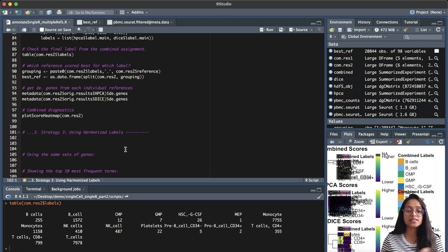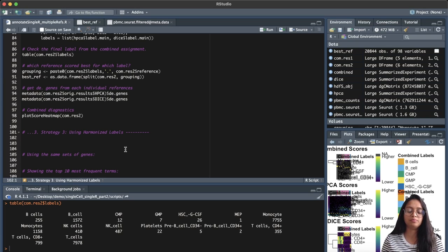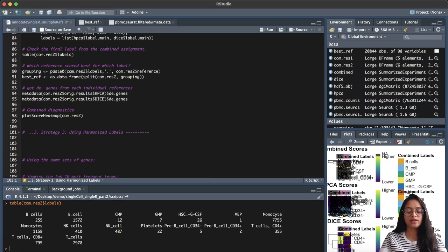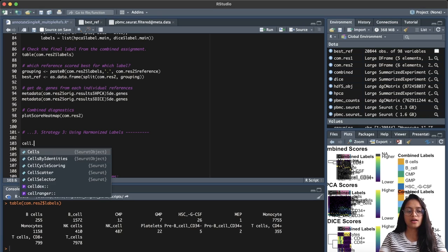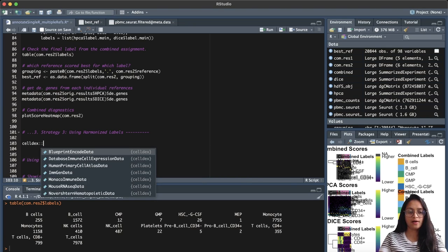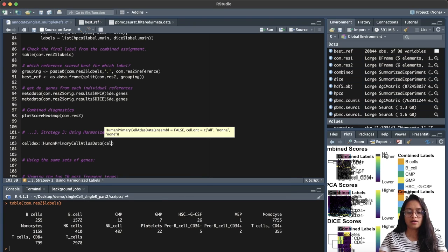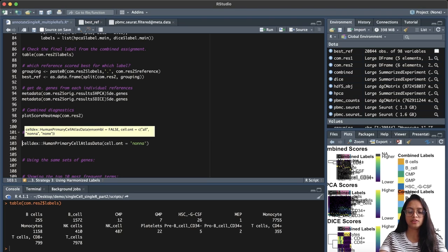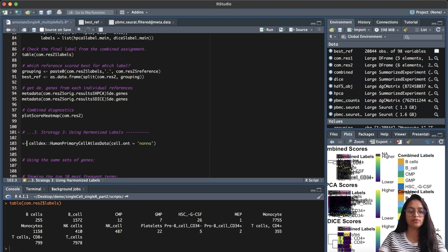We will use Cell Ontology terms instead of gene names in the SingleR command — in place of labels we provide ontology terms. These ontology terms refer to the same conceptual cell using the same term across each reference, so the resulting annotation will use the same vocabulary regardless of which reference it comes from, taking care of inconsistencies in labeling across different references. Let us retrieve the reference datasets and this time exclude the samples that could not be mapped to the ontology, setting the cell ontology to non-NA so only non-NA samples in terms of ontology will be retrieved. We repeat the same process for the other reference as well.